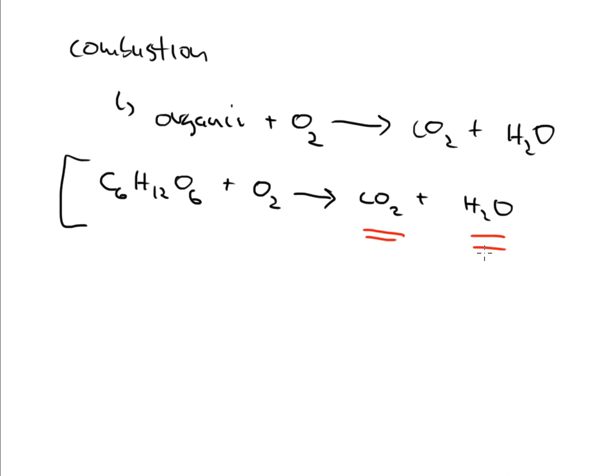So we get a machine. And this machine is developed. And this machine understands this concept. And it says, all right, if you have a sample of something, and that sample gets injected onto the TOC instrument, that sample could have organic type of material in it. And that organic type of material that's not purgeable, NPOC, will stay in that water sample.